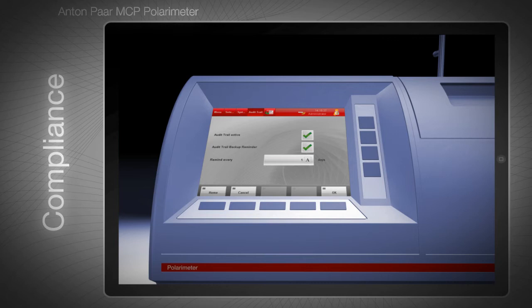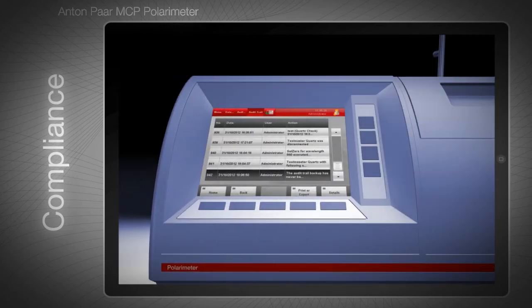Please refer to the separate video about Toolmaster for more information. All audit trail entries can be exported either in list format or individually. A backup reminder can be set for certain intervals to remind the user to export the entries.